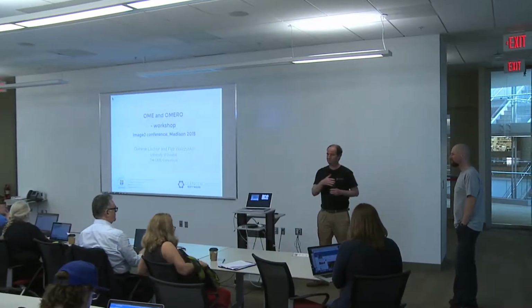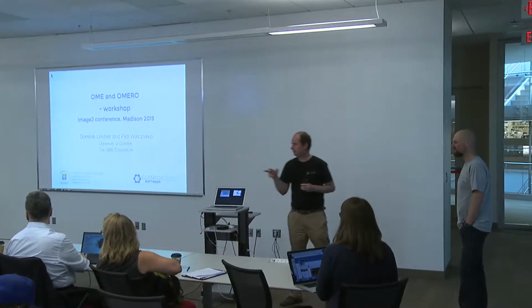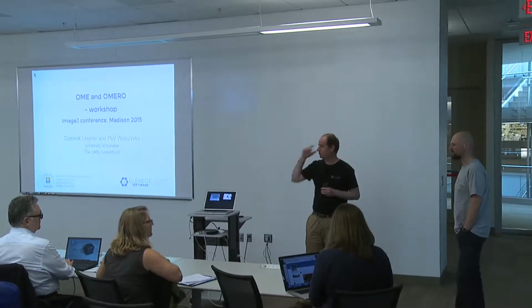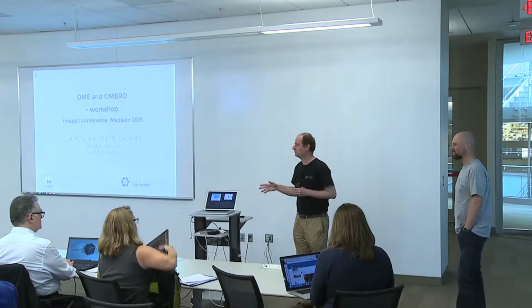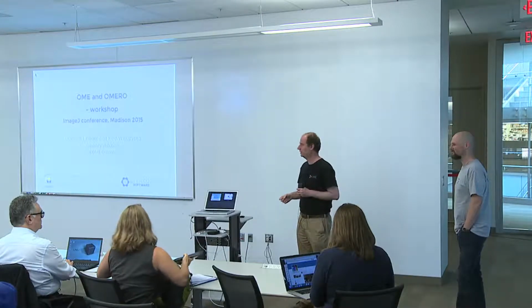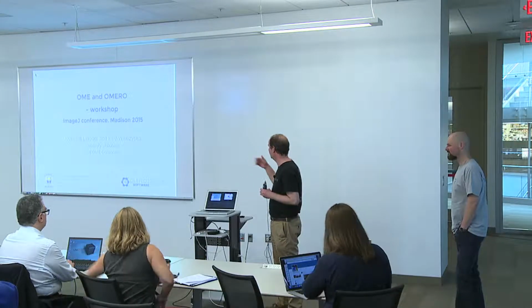Now, we have some setup to do. Dominik should have approached you with a leaflet and credentials, and it's quite important to do it so that you don't completely lose the track. But if you lose the track, I will show something for your entertainment anyway here.